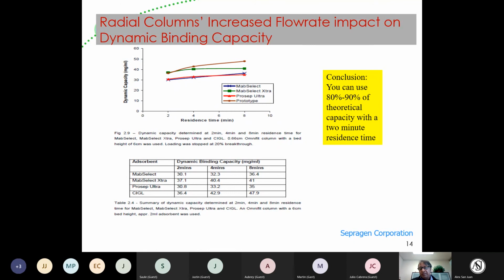And so what we tell people is, look, overall productivity is so much more. If you're that concerned, firstly, with mAbs you have overproduction, with 4 to 5 grams per liter in the cell culture. Your cycle time is more important than 5% binding capacity. You can just have a column which is 5% bigger, so it's not that big a deal. Or you can optimize and say, okay, I'll run 2x faster or 3x faster, and that's the optimum I choose to use. You have that flexibility.